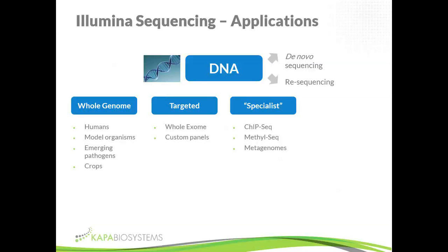And although Illumina sequencing is a DNA sequencing technique, we can turn RNA into DNA, into cDNA, and that also allows us to do RNA sequencing. Not directly, we don't directly sequence RNA molecules, but through the cDNA intermediate. And so that allows us to look at gene expression, so the different things expressed at different times in different cells in the body or in different populations of samples. It allows us to look at gene structure, for instance.